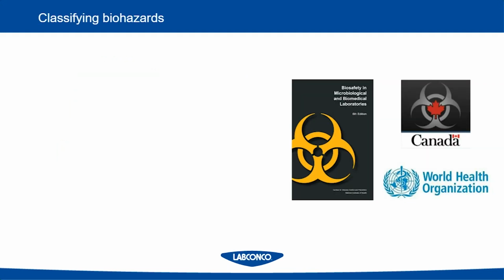When it comes to classifying biohazards, every country has different regulatory agencies. Within the United States, we primarily work with the CDC, and the CDC publishes a guide called Biosafety in Microbiological and Biomedical Laboratories. Canada has their own version of this guide, and the World Health Organization has a more global standard.